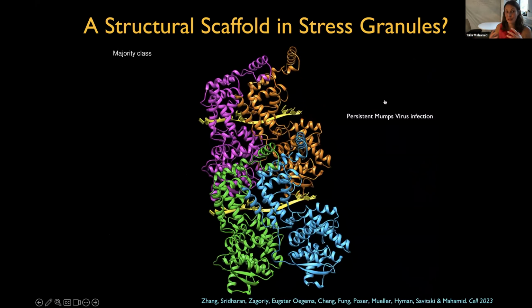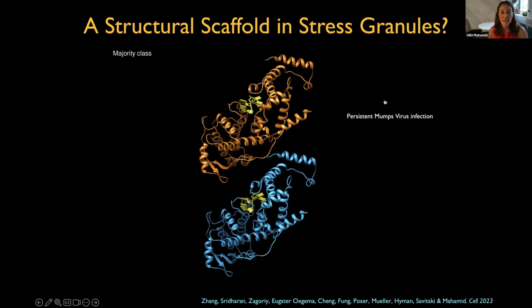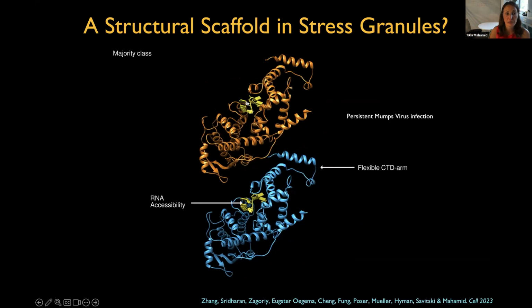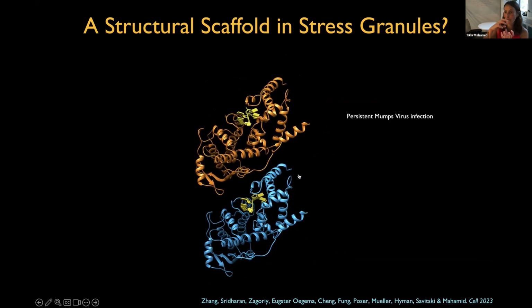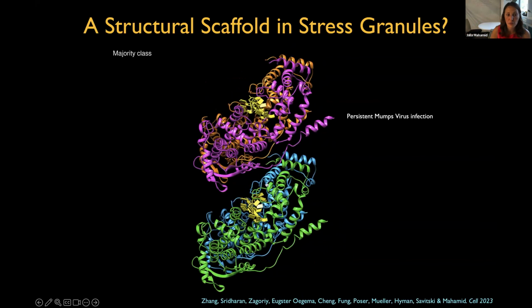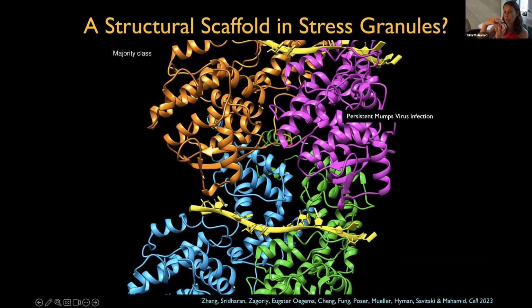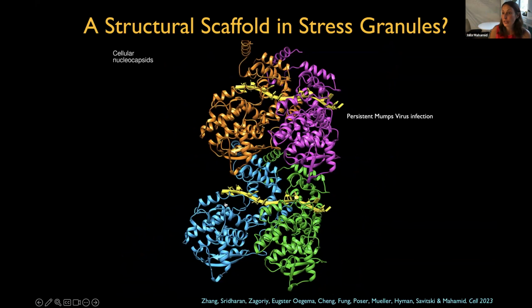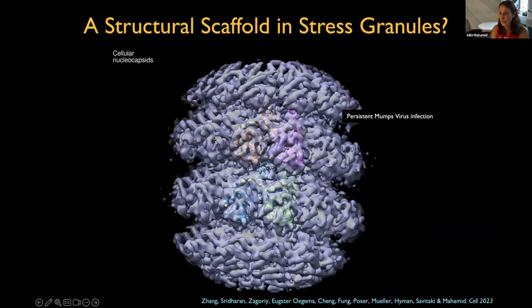So this is really where obtaining a structure based on an in situ cryo-electron tomography map led to an identification of the components. Now, there were no structures for mumps virus nucleocapsids, so we went ahead and built a full atomic model. We were able to determine two conformations of these nucleocapsid subunits, in which the major difference was how much the viral RNA here in yellow was exposed to the environment on the nucleocapsid surface. Now, that was very intriguing, these two conformations, because this data comes from what was happening directly inside the cell.